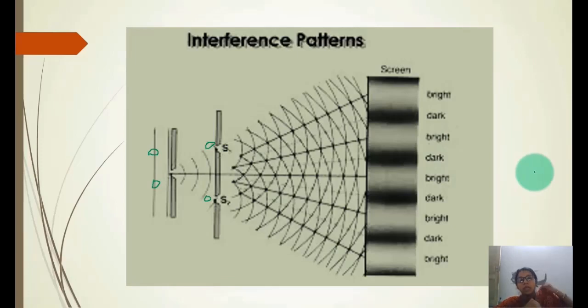So now we discuss how diffraction of light is different from X-ray diffraction. But before that, we must know what X-ray diffraction is. So you must know, whenever we observe light diffraction, we observe a pattern of bright and dark fringes, and these fringes have an intensity difference. That means one fringe is very bright, that is the central fringe, and then as we keep on going away from this bright fringe, another bright fringe will have intensity lesser than the central, and the second bright fringe, or the second principal maxima, will have lesser intensity as compared to the first maxima.